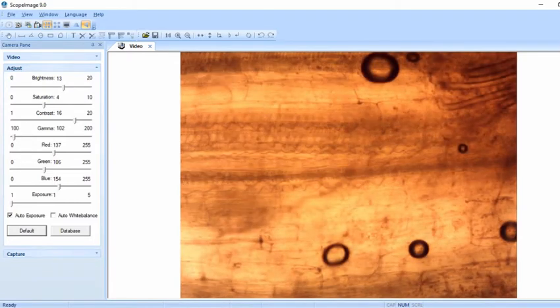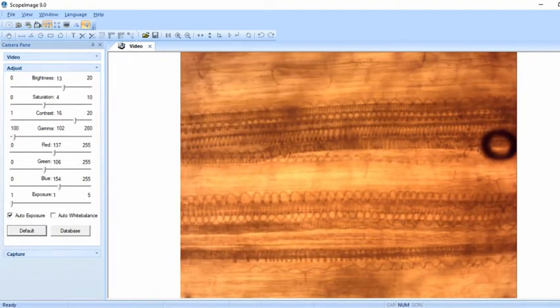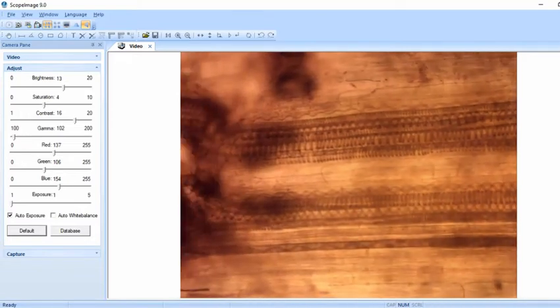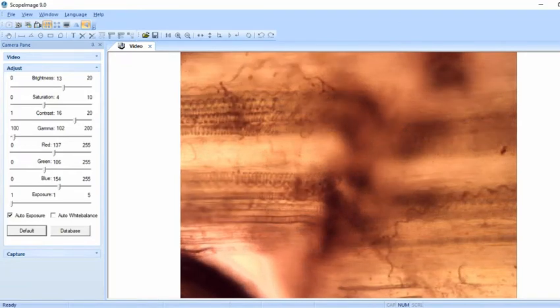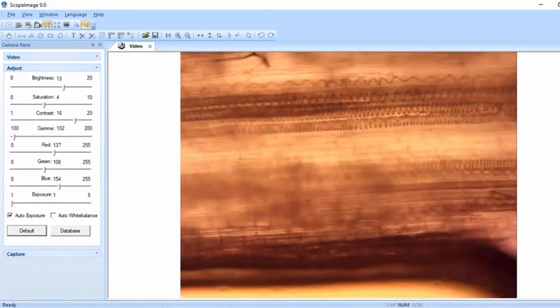The vascular tissue has this weird spiral pattern to it, kind of like little coils. And I found it's usually in the veins, I guess you can call them, in leaves, but it's in the stems too. This is a very thinly cut piece of stem right here. So you have the stems and you have the leaves, and I'm finding these spirally fluid channels. I'm not a botanist. I have no idea why they're like this.